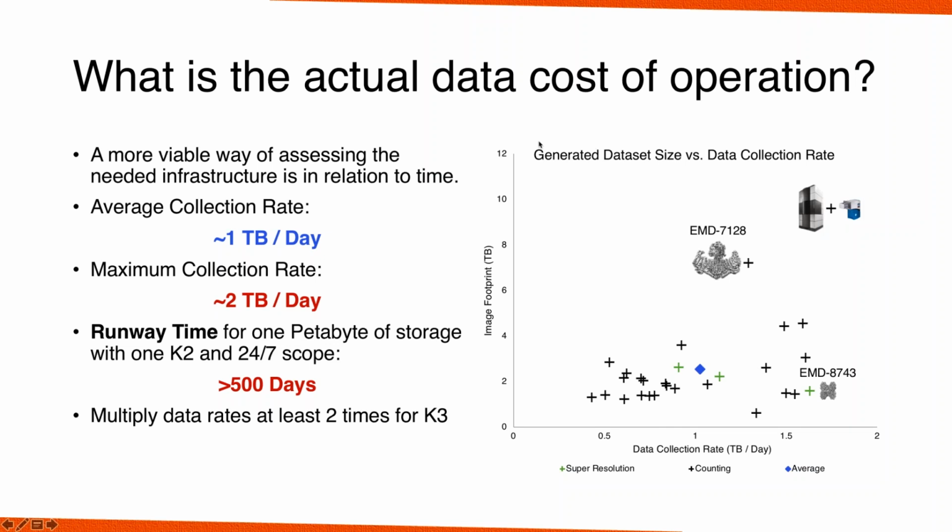And that's the time from when the microscopist sat down and started aligning the microscope to the time they got up with their last aligned frame. So this is real data taken from, I think, all 10 users, 28 sessions, something like that. Like I said in the last slide, what we really want to think about when we're designing storage to hold all this data is that the maximum collection rate is about 2 terabytes a day. And that's what we're seeing here, of course, with the K2.